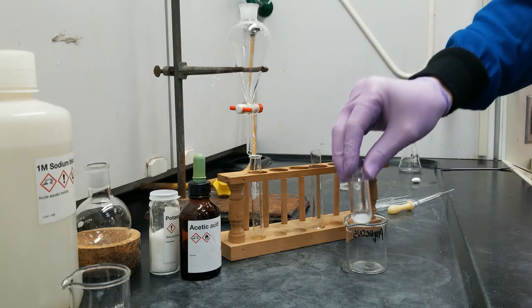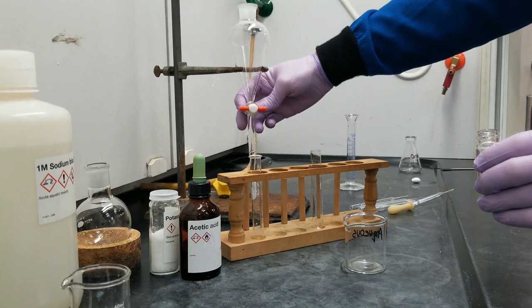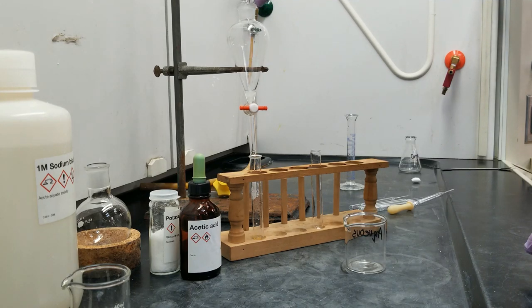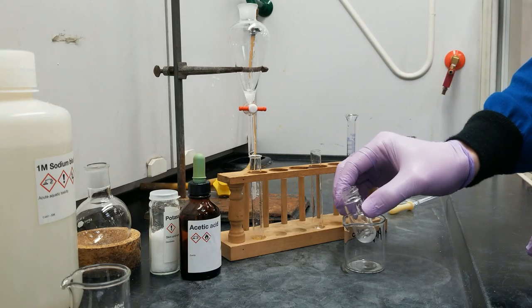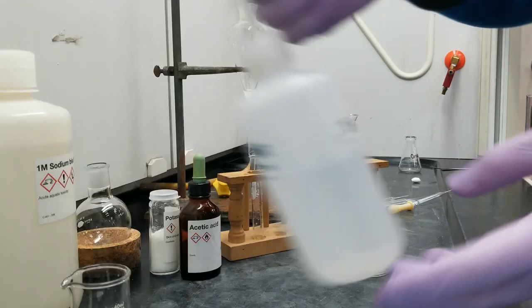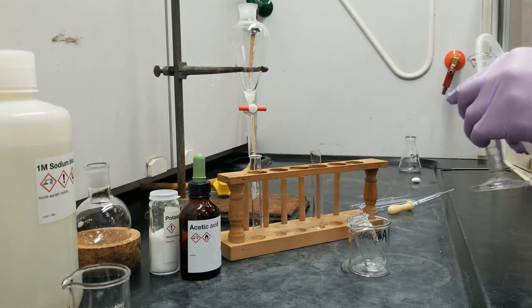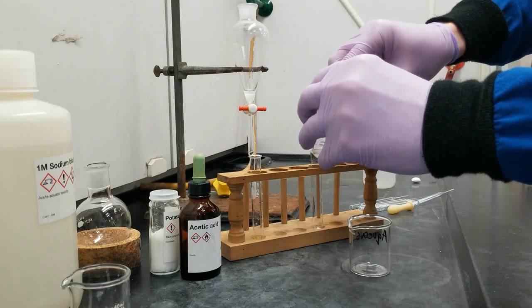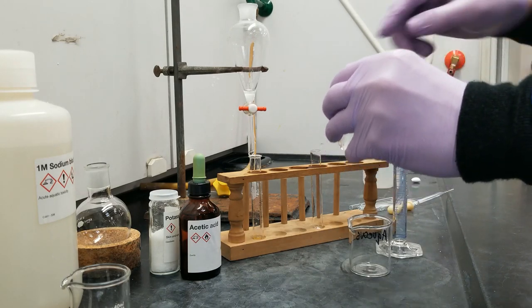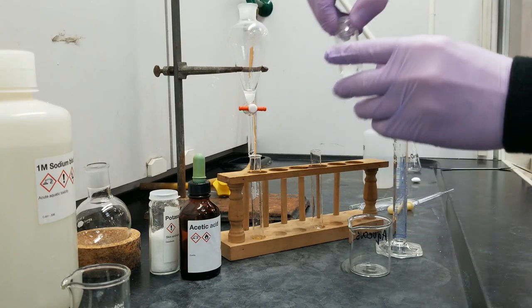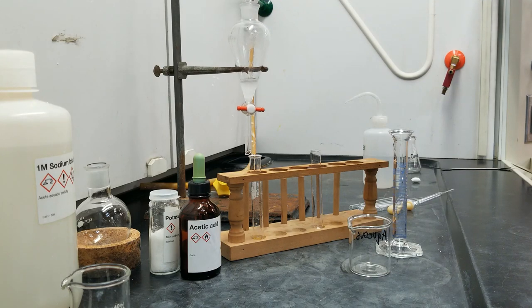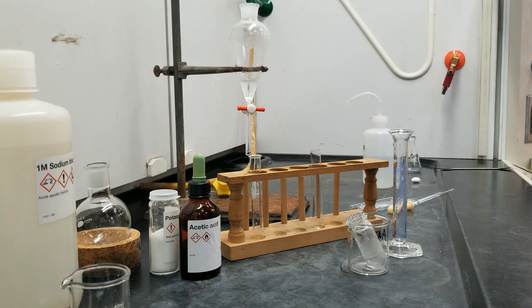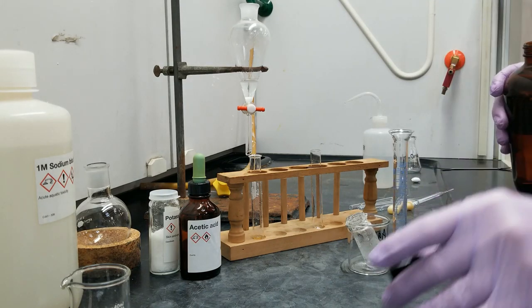So make sure that my separatory funnel is in the closed position and I'm just going to go ahead and dump this in. And the next thing I'm going to extract with is 5 milliliters of water. And I'm going to run that through my reaction vessel first just to make sure that the contents of that vessel all make it into the separatory funnel. And then we're also going to extract with 8 milliliters of ethyl acetate to provide more of an organic layer for our product to get dissolved in.